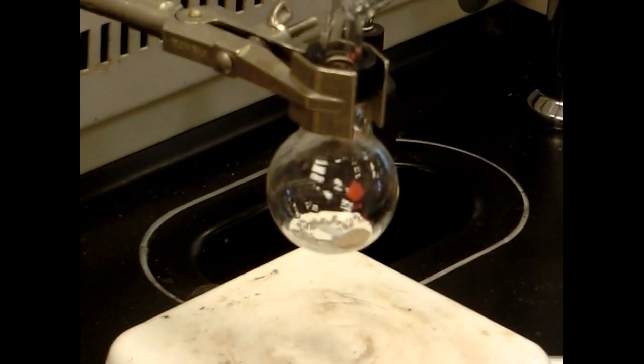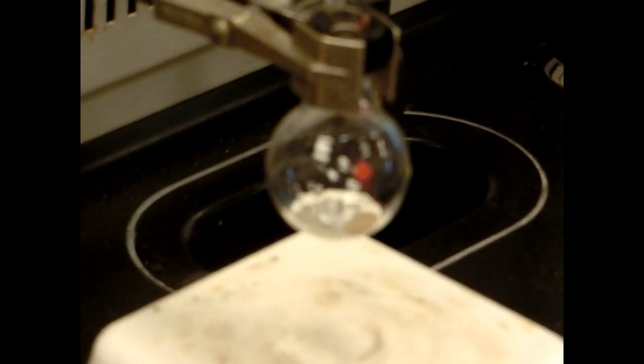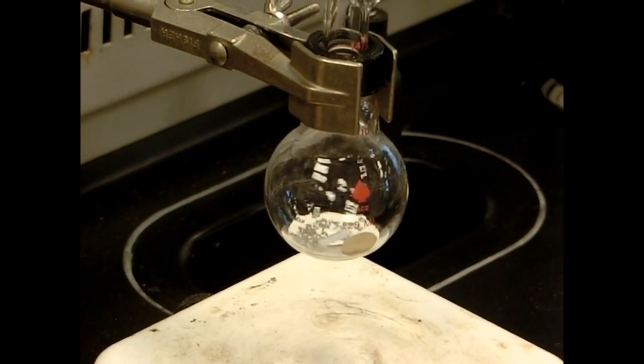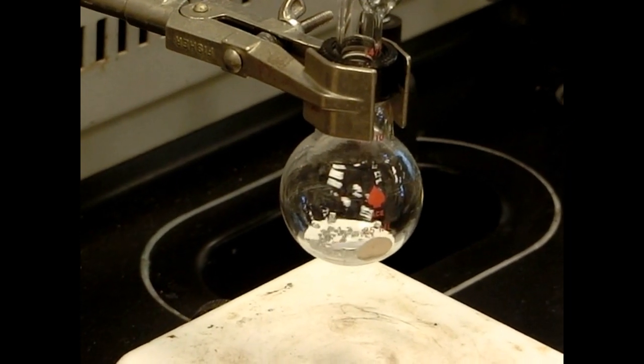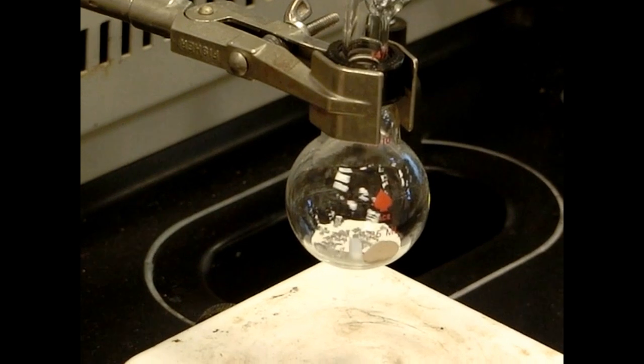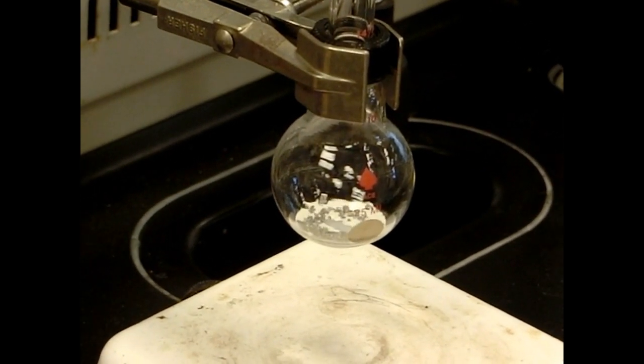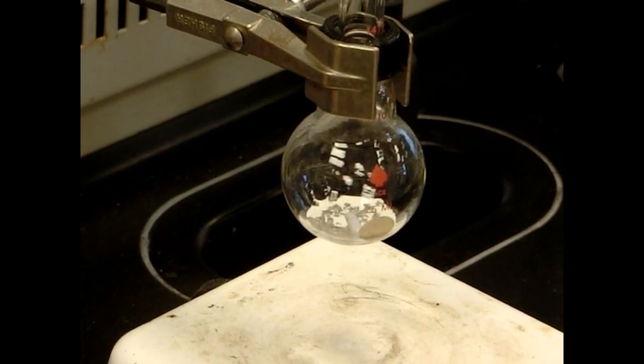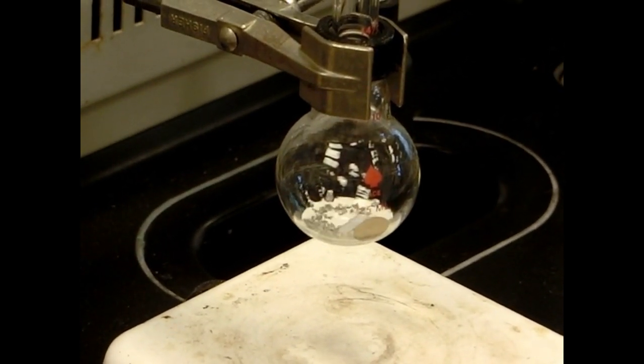Now at this point, what we're waiting for over time is the solution should turn a little bit cloudy and a little bit of a light brown color. The more intense brown it gets, the more Grignard that we're making. Again, this could take anywhere from about 15 minutes to about two hours. It can be a very slow reaction. So for now, we'll wait and hope for the best.